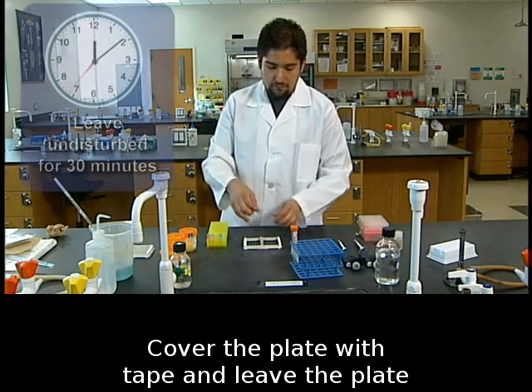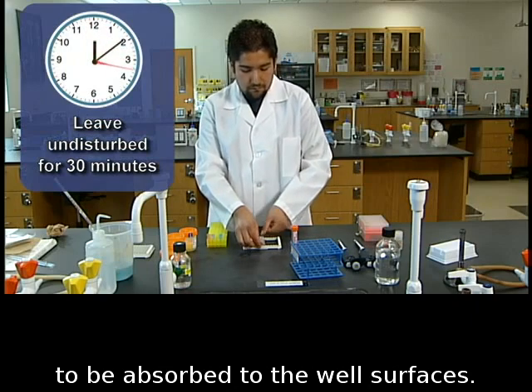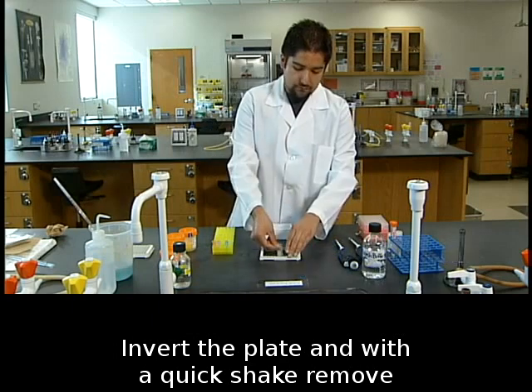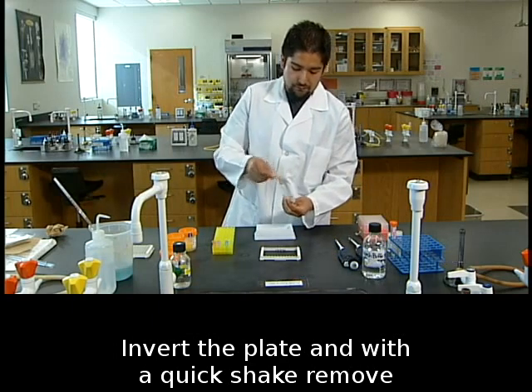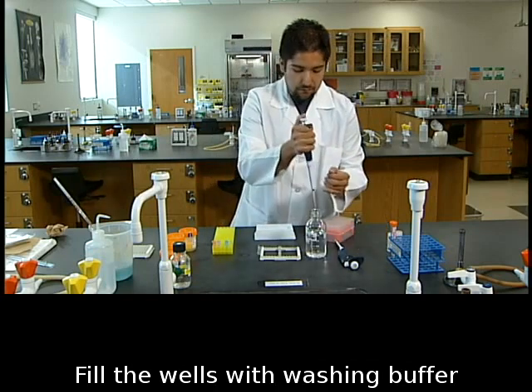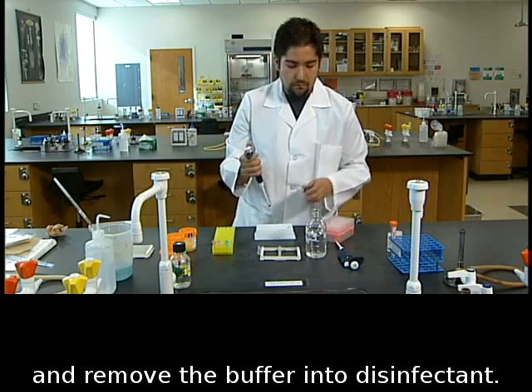Cover the plate with tape and leave the plate undisturbed for 30 minutes to allow the antibodies to be absorbed to the well surfaces. Invert the plate and with a quick shake, remove the liquid into disinfectant. Fill the wells with washing buffer and remove the buffer into disinfectant.